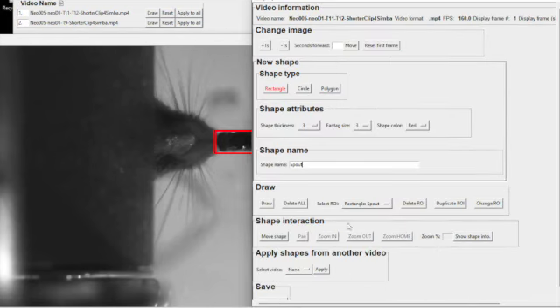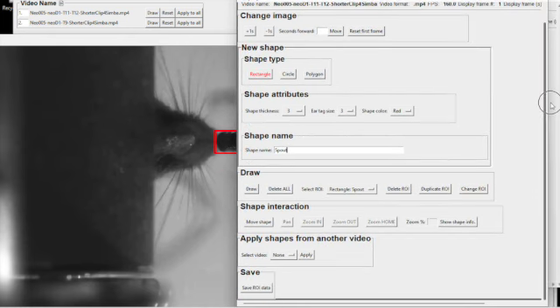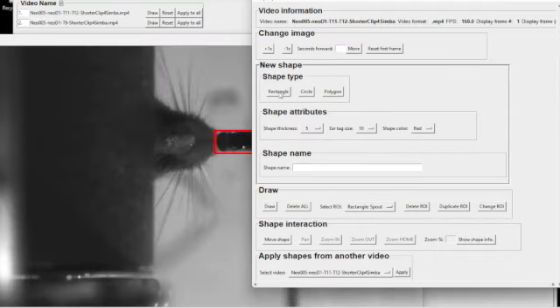So you can't even really see it here. Drag this down. So here's the save ROI data. If I'm going to create multiple ROIs, this interface can act up a lot, and it will just shut down the entire program on you. So it's safest to create one ROI, close out of the box, and then go back into that same video and draw again.